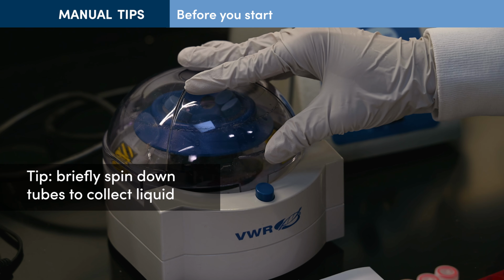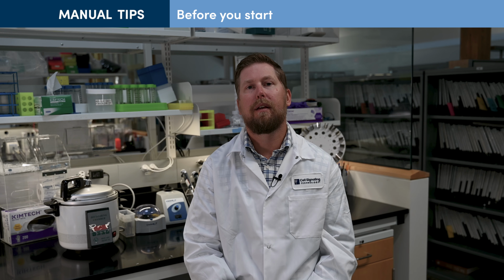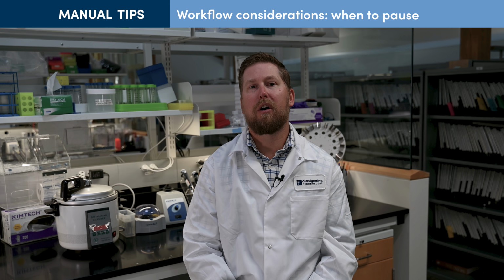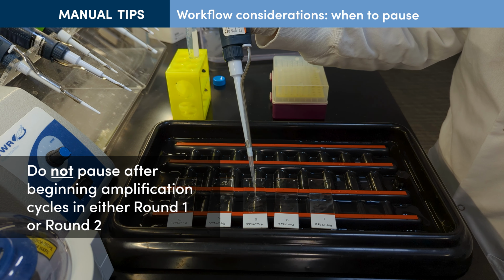Briefly spinning down the stock tubes containing antibodies or oligos for a few seconds can help to collect liquid that may be on the cap or walls of the tube before dispensing. If you need to pause the protocol to spread it out over multiple days, you can extend the imaging round 1 solution incubation containing the antibodies to overnight at 4 degrees Celsius. Once you have begun the amplification cycles in either round 1 or round 2, do not pause the workflow at any point.